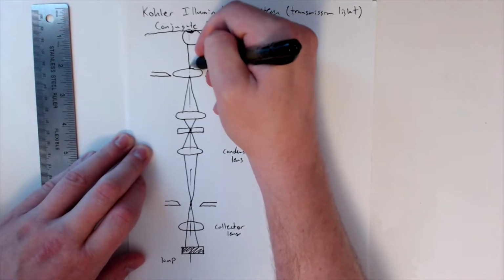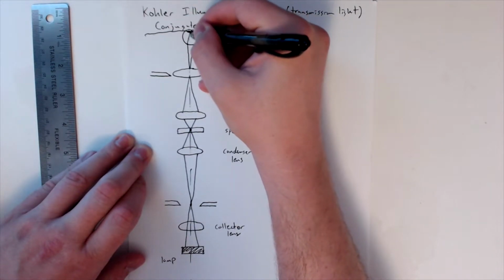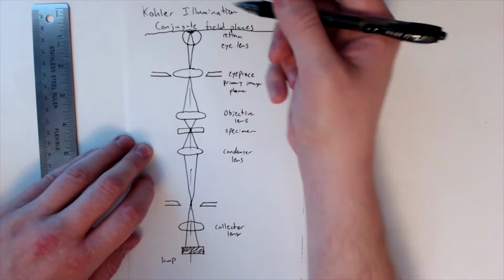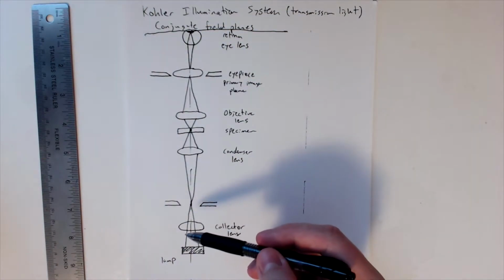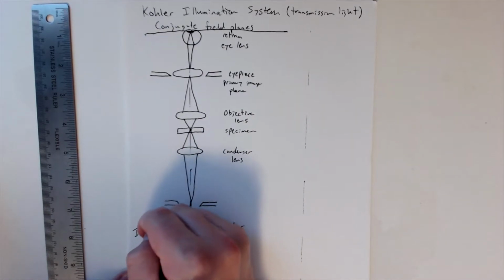goes to the eye, focuses it, or converges it to the retina. And then again, we don't perceive the image on the retina, we perceive it in front of the eye, away from it, as a virtual image. All right, so this is the configuration that's used for image formation.